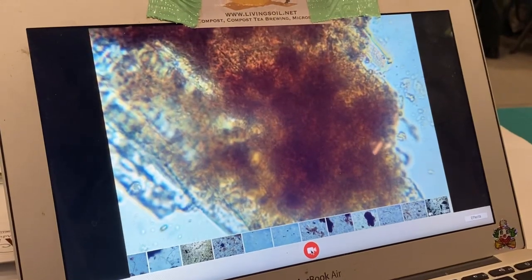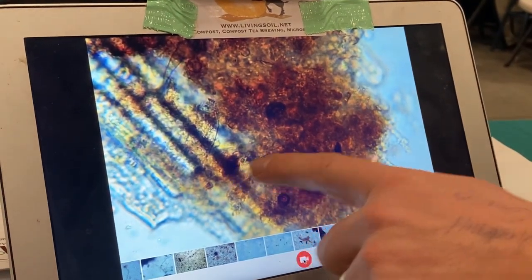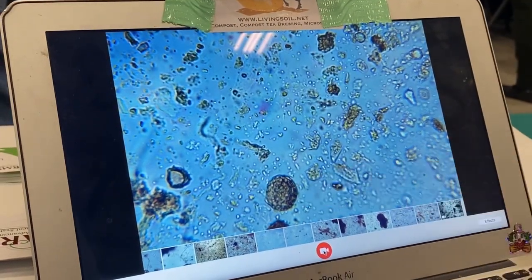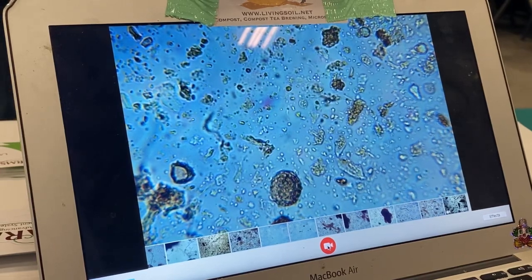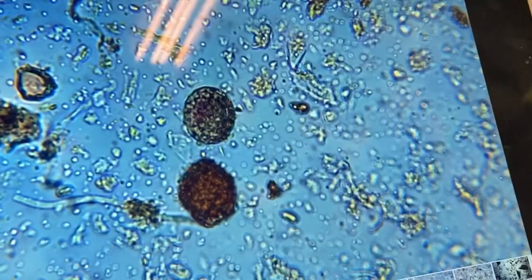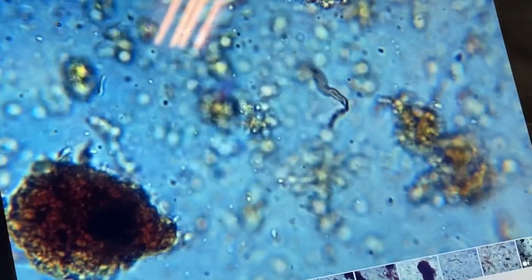Here's some humus formation right there on the surface — you can see it as we roll through all the layers. Got some fungal spores in there, which is good. That might actually be a testate amoeba — just like the snails of the soil, it's a good protozoa. There's a fungal spore, and that's fungi coming out of it — there's fungal hypha right there.